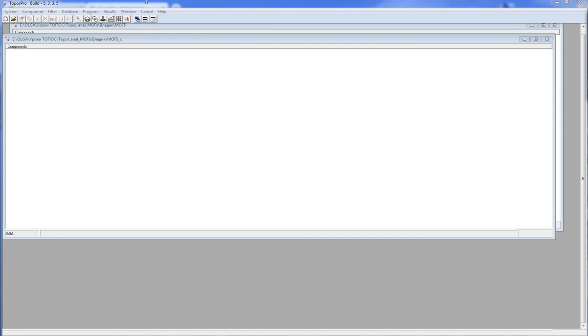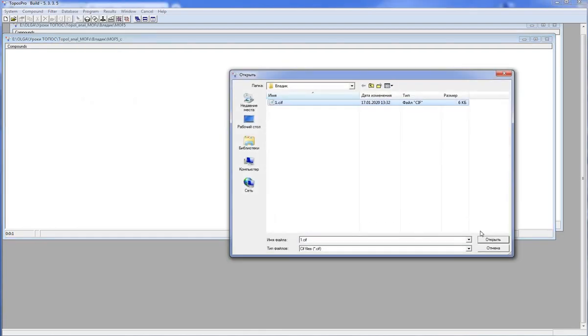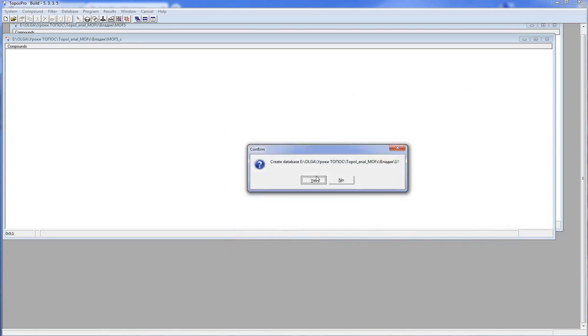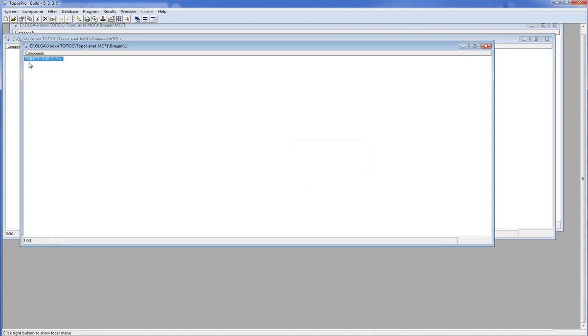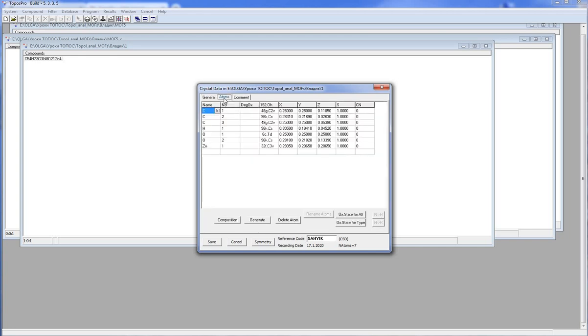Let's look at the example of MOF-5. We start from importing the data from a CIF file. Topos Pro creates a new database. Let's open the crystal data window. This is standard crystallochemical information: space groups, unit cell parameters, atomic coordinates, but there is no information about atom connectivity.